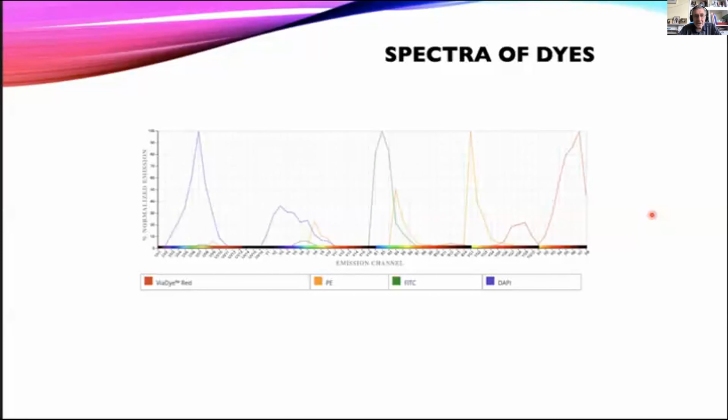Okay, so I'll come to that in a couple of slides' time, but dead cells will cause us problems even in our analytical experiments, because they change metabolically, so they change their fluorescence. Their autofluorescence level will change. And because they become permeable, they can take up antibodies and probes non-specifically. So we might see some non-specific binding, and that could be a particular problem if we're actually looking for just a small shift. We want to be sure that's real and not just due to a dead cell. So we should always target those dead cells. And there are ways of doing it, which I'll come to in a couple of slides' time.